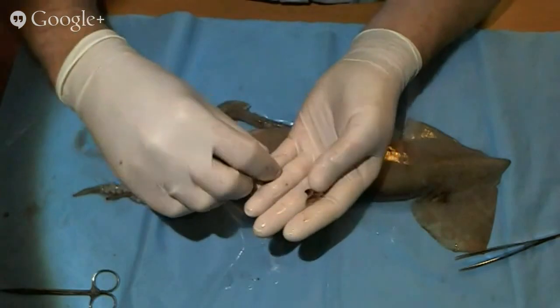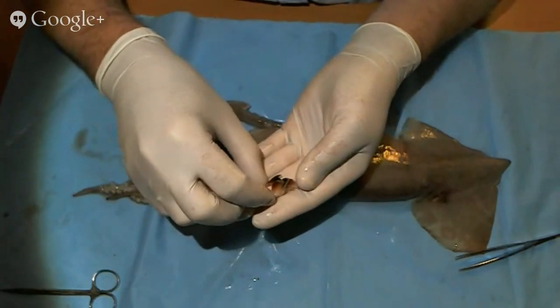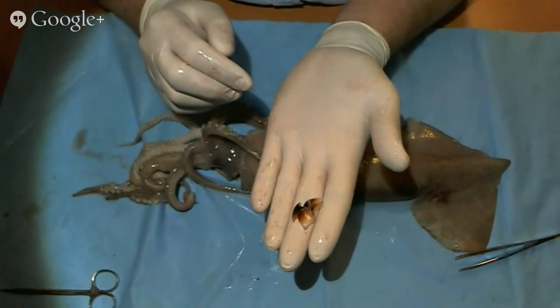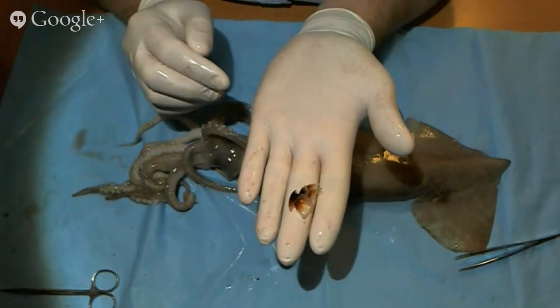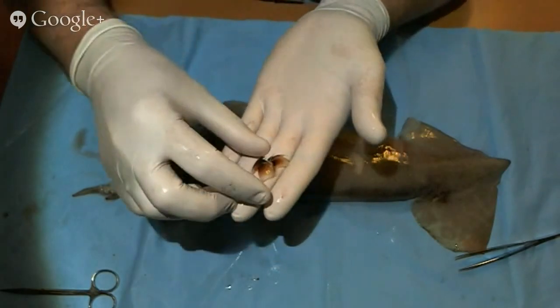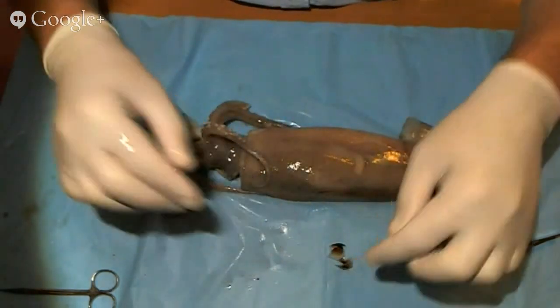So you can see the two parts that are there. And it looks a lot like it would be a beak that would be on a bird, like a giant hawk or an owl or something like that. And then save that for a little bit, because looking under a microscope at that is a lot of fun.